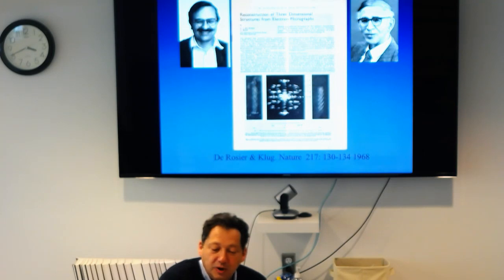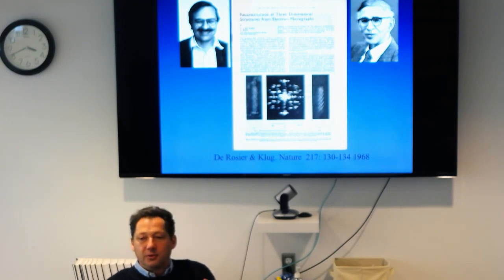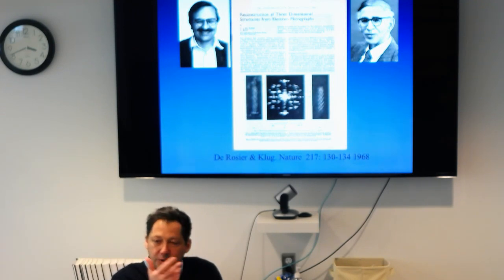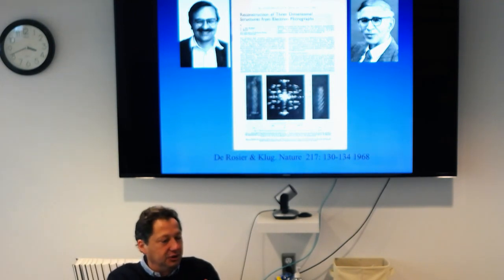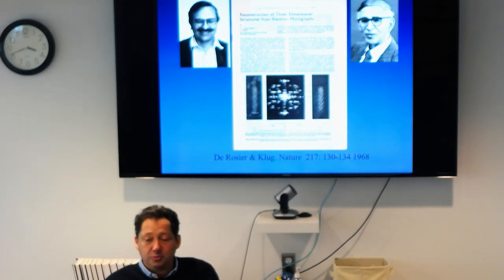So what I was mentioning before, why historically a helical specimen was the first specimen that we got a three-dimensional structure from in EM as a particle, okay? The reason why is going to become obvious, but basically in a helix you see all the views without needing to tilt your specimen. So in principle, with only one specimen, you should be able to obtain a three-dimensional reconstruction.